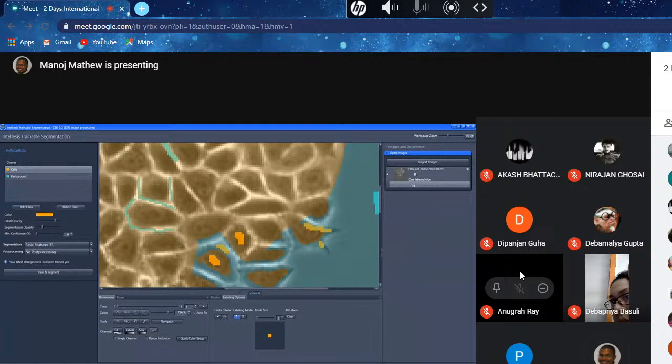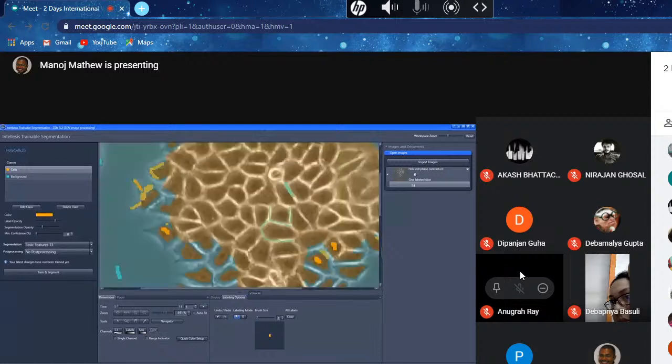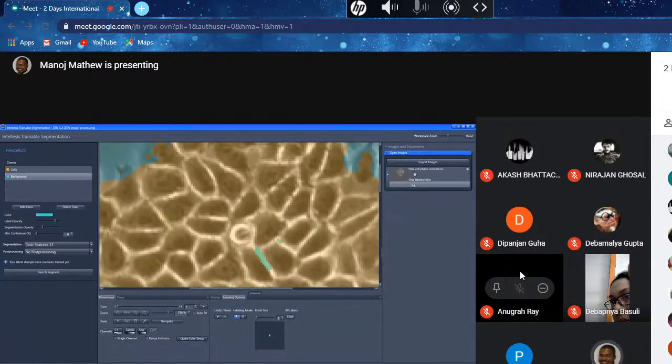One thing you have to observe is that the more I train, in this process called labeling, the more labels I put, the computation is going to start becoming more and more intense. So my goal is to use as few features and as few labels as possible. That will optimize my model and help you complete the segmentation in the smallest possible time, or let's say with minimal computational effort. Maybe I might want to train a little bit more in these regions here.